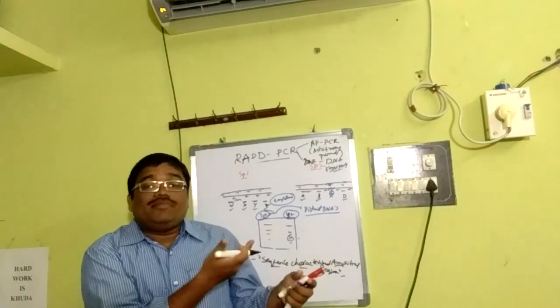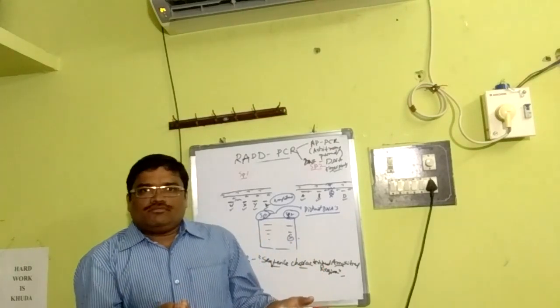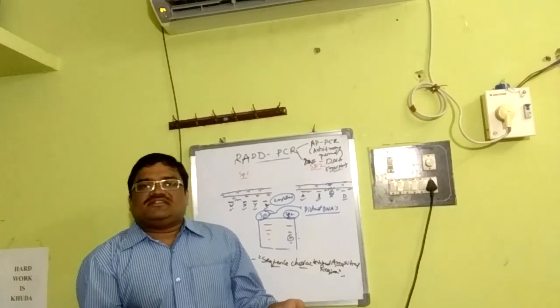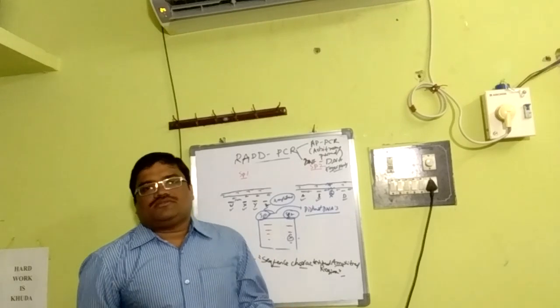Just like in PCR there are different variants, like inverse PCR, anchored PCR, RACE, the same here also. Okay.